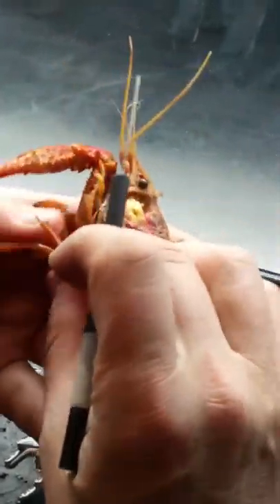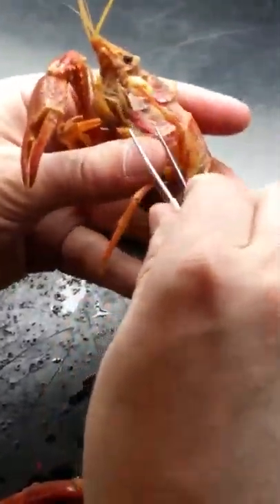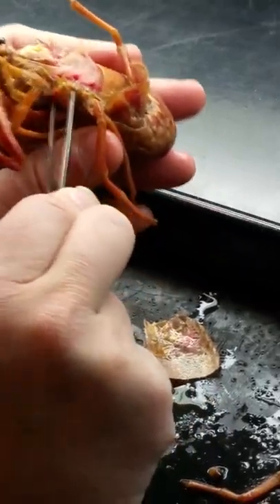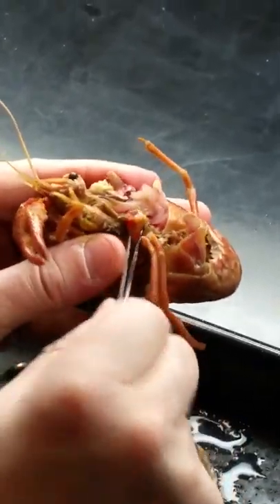What I'm going to do is pull the base of the cheliped off. It's important to get the base off because that allows access to the basis of the other appendages.